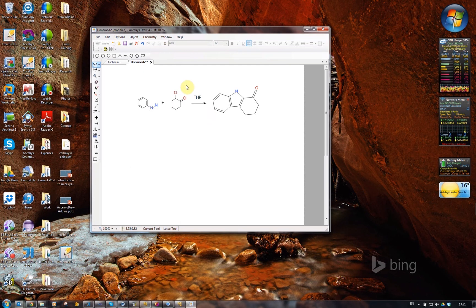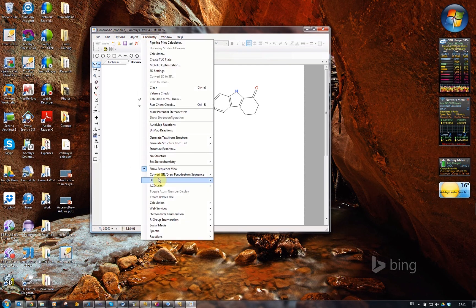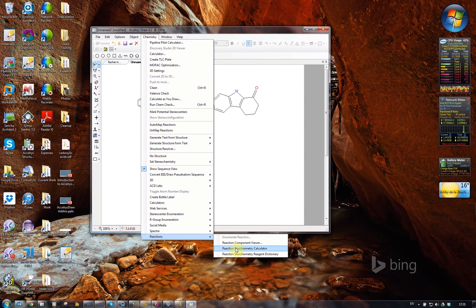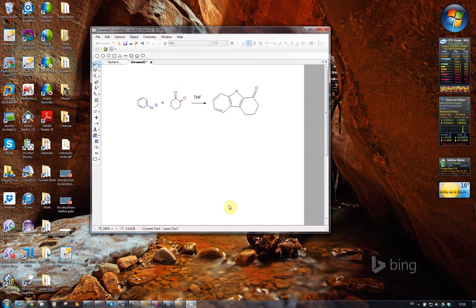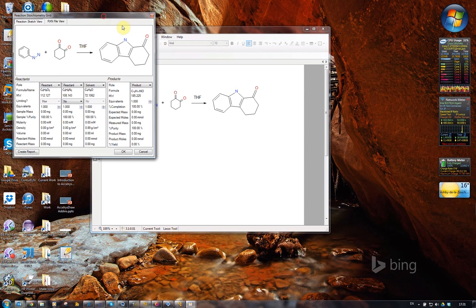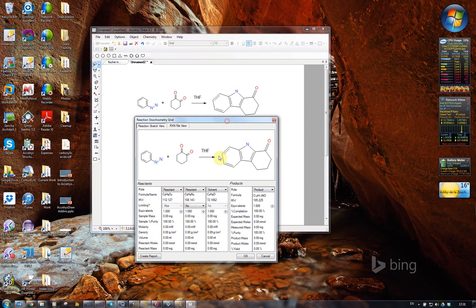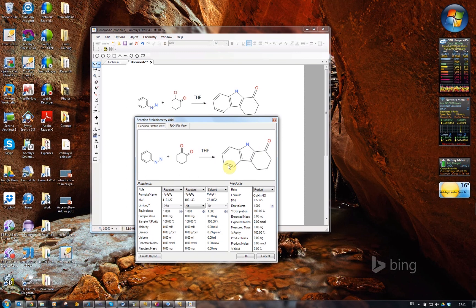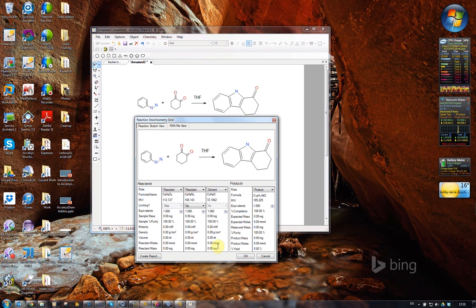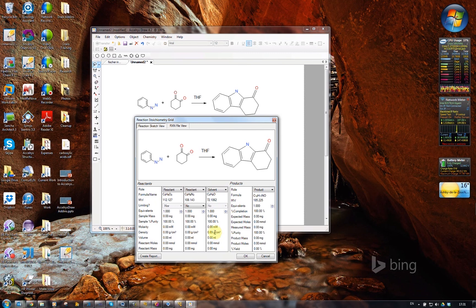I can go in now and click in the chemistry menu again and choose the reaction stoichiometry calculator. There we see, this looks exactly like what we've got up here, but look, it's got a solvent column. In the reaction stoichiometry reagent dictionary, we can define solvents. That's where it's getting this density from.